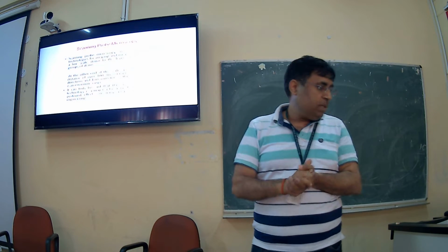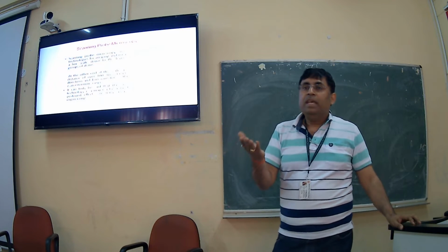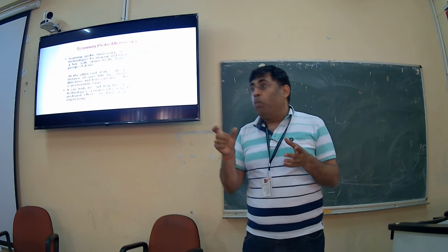Okay, now after that we will move on with scanning probe microscopy. Again, here I will tell you one word: probe.